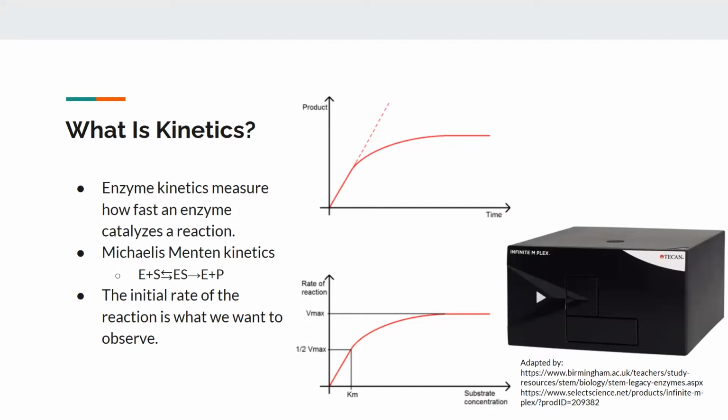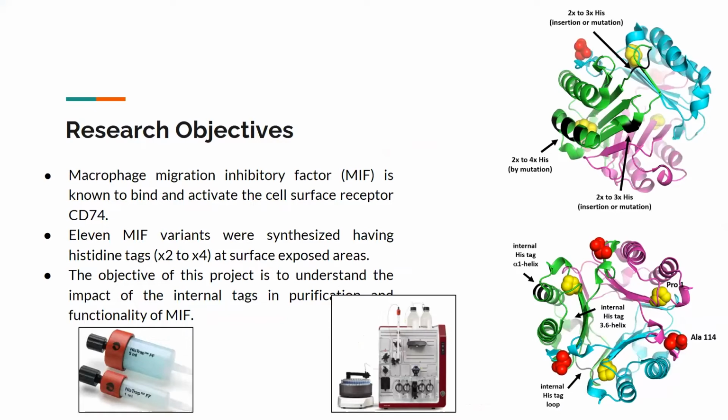So moving forward, what we want to do is take, because there's other proteins that are similar in structure to this, that have a similar shape. And some of those don't purify as easily. And so we want to add these tags to those to hopefully make them easier to purify. And also make sure that it won't impact the structure of it, because then you can't use it to purify the protein.